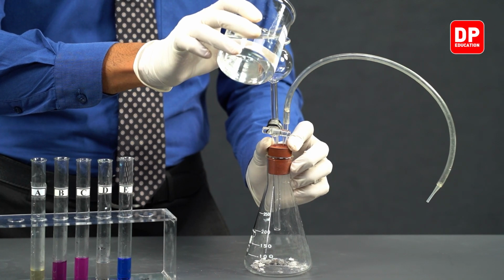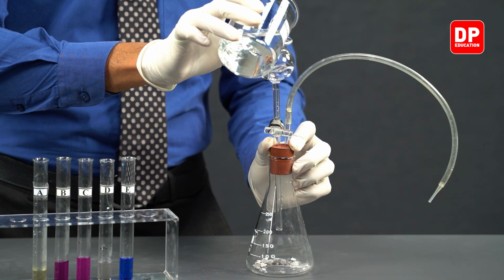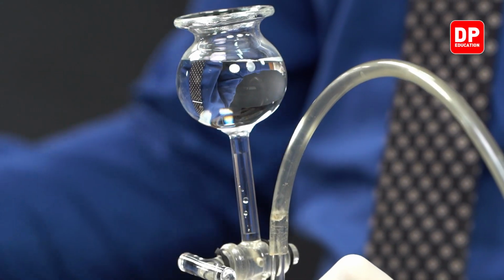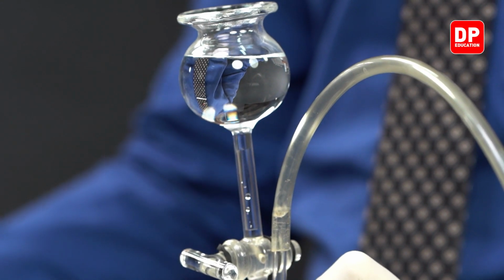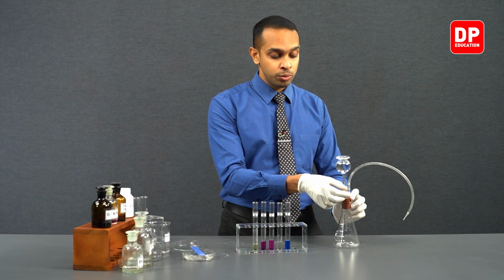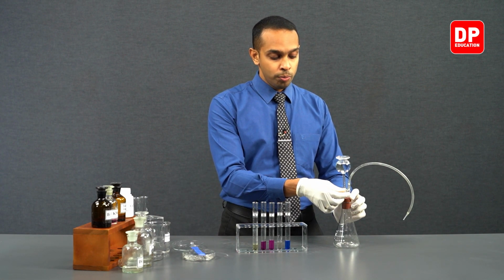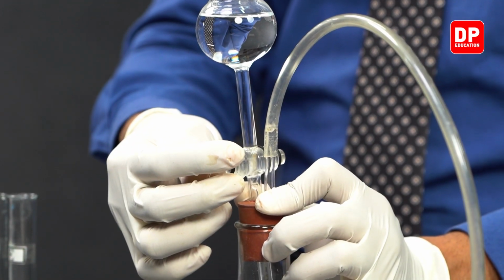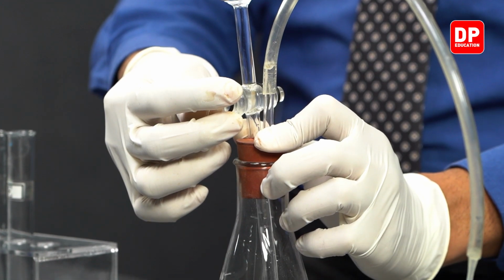We have distilled water here. Let's add a small volume of water into our Thistle funnel, and we can now proceed to open the valve and introduce water gradually onto our calcium carbide.